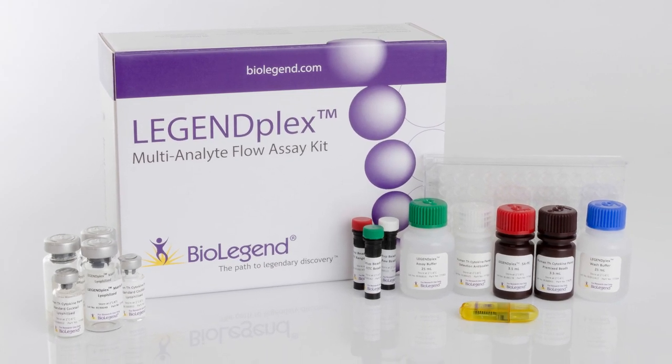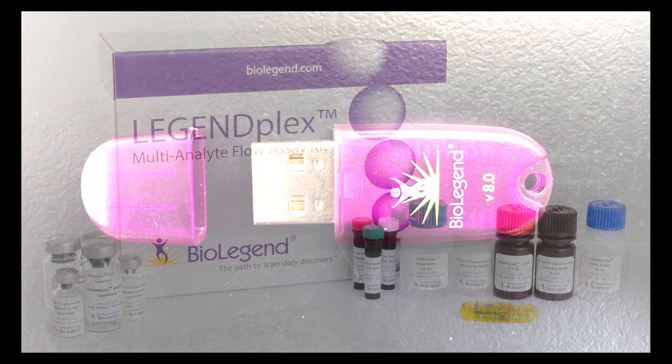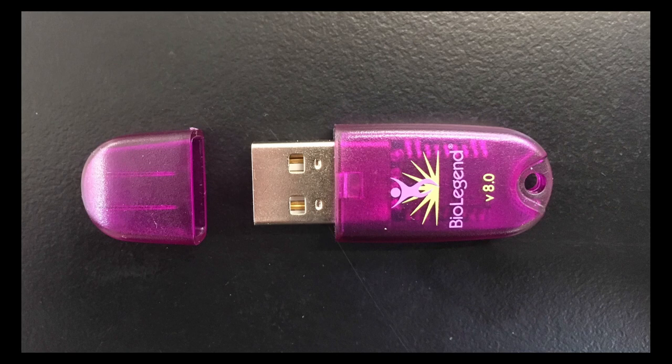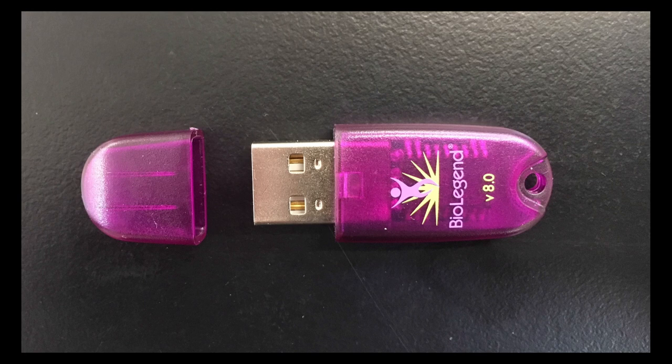To begin, insert the USB dongle, which was included inside your LegendPlex kit, into a USB port on your PC. The dongle is used as the license key for the software.